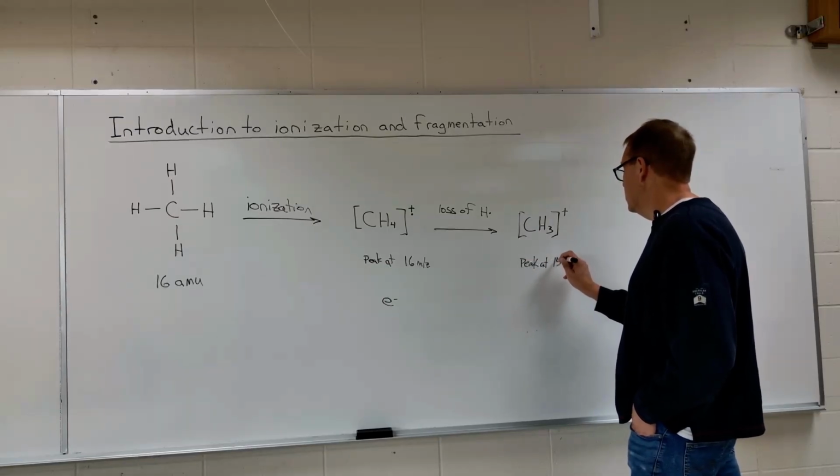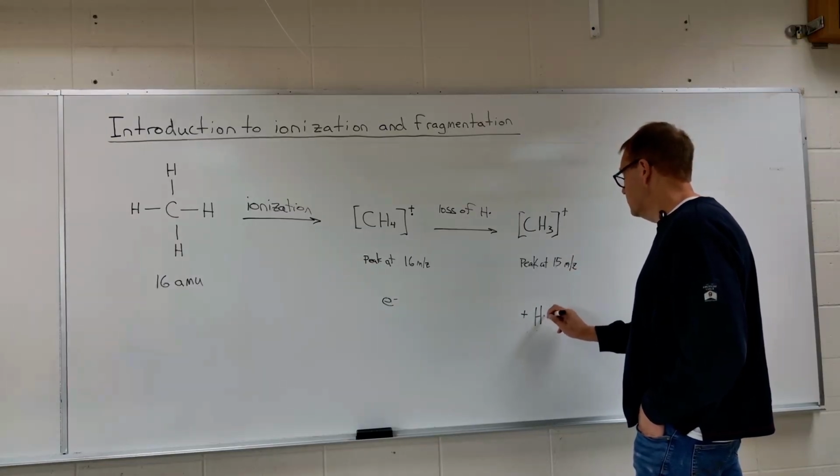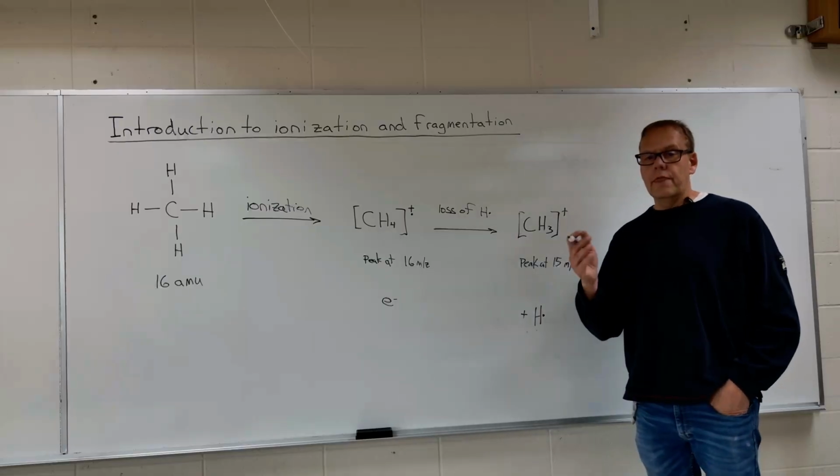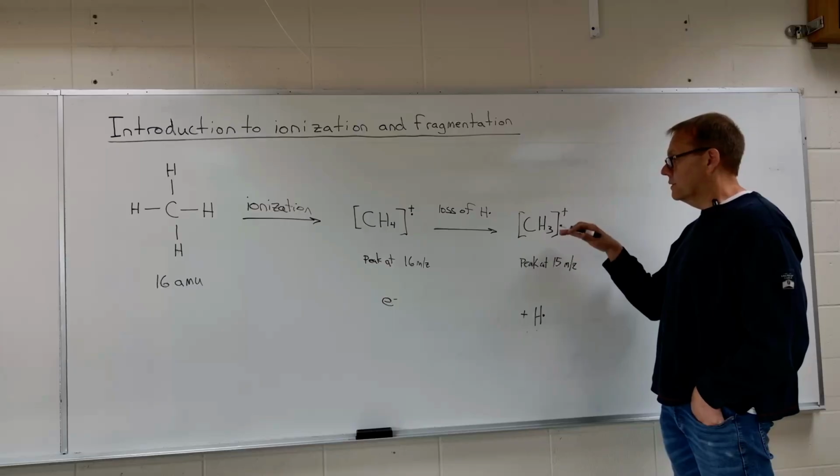Peak at 15 m/z. And there'd be an H dot, which is a neutral atom. So that's one that doesn't show up in the mass spectrometer.